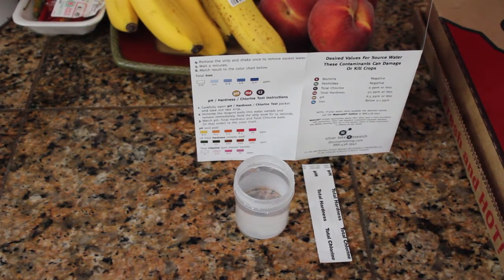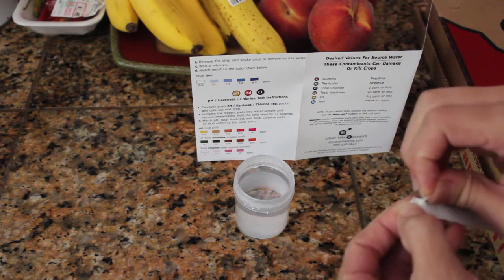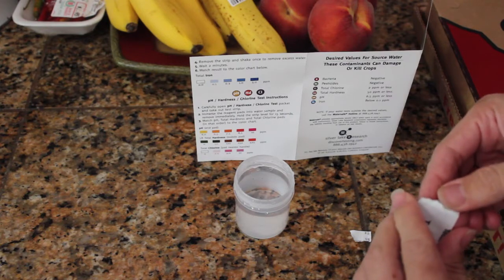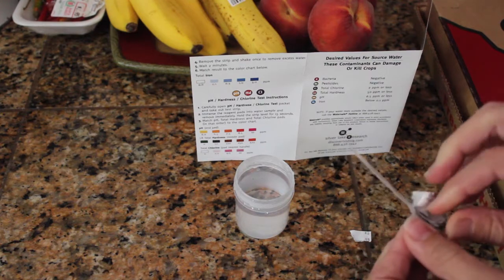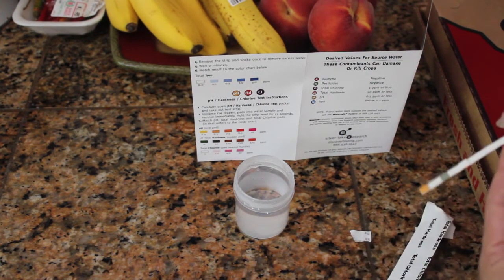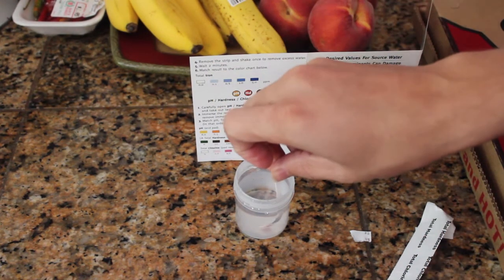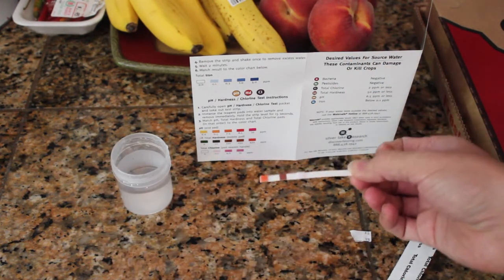Our final test, the last of the four, is going to test for three different things: it's going to test for the pH, the hardness of the water, and also the chlorine. This is the fastest of the four tests. All we're going to do is take this little test strip out of its case, dunk it in the water real quickly, then immediately remove it and hold it level for 15 seconds. After 15 seconds it should give us a reading on all three of those metrics, which we will then compare on our chart.